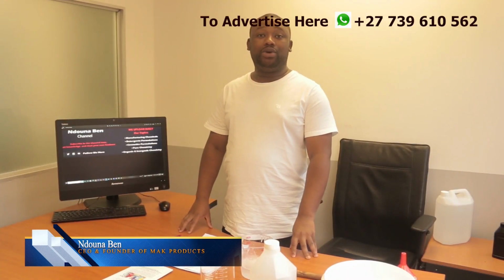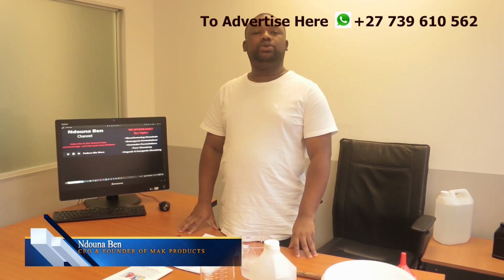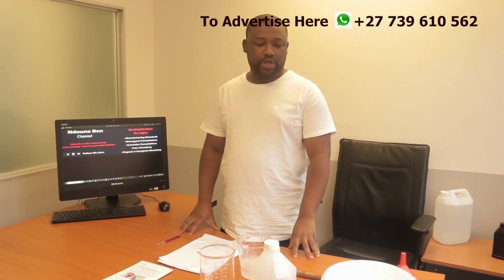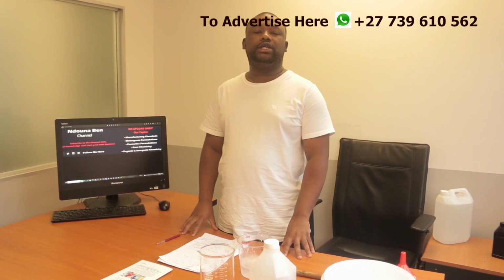In this video I'm going to show you in full details how to dilute 95% isopropyl alcohol to 70% isopropyl alcohol. Okay, it's going to be a full manufacturing session.